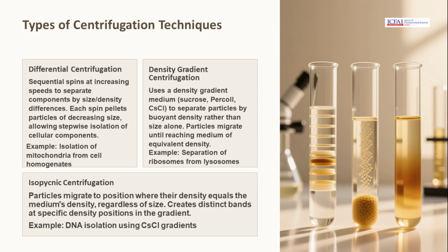Centrifugation techniques vary based on the separation needs. Differential centrifugation uses sequential spins to separate components by size and density. Density gradient centrifugation employs a medium to separate particles until they reach equilibrium. Isopycnic centrifugation allows particles to migrate to their density equivalent position, creating distinct bands for analysis.